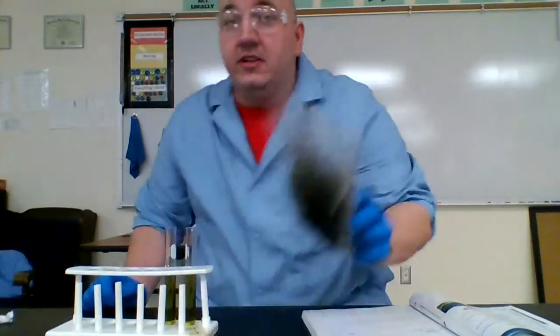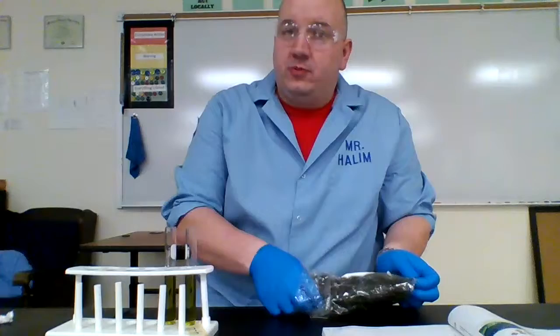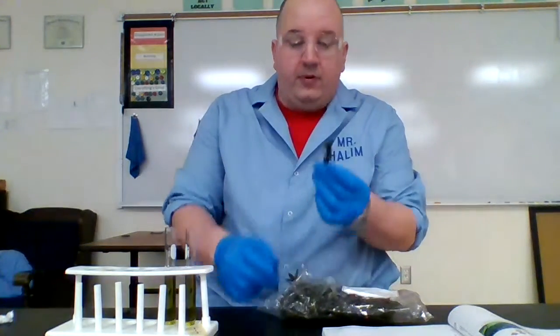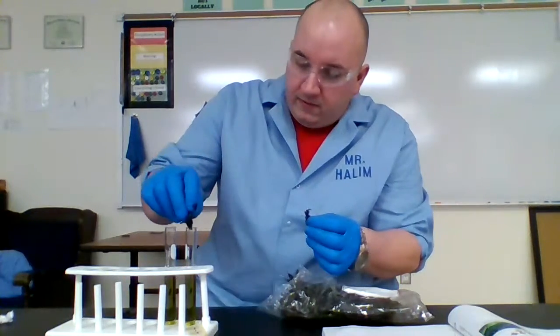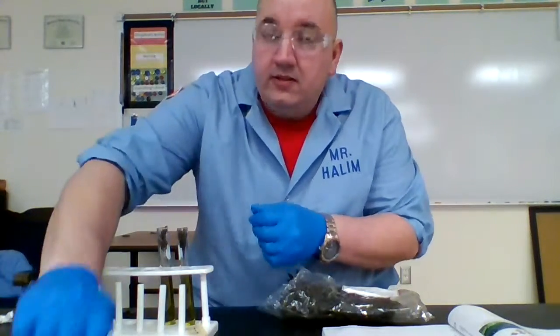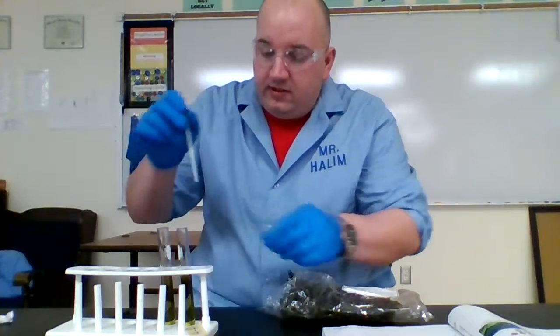So at this point, you're going to need to see your teacher, and you need to get a couple sprigs of Elodea plants. You're going to need to get 2 of them. We'll probably give you one chunk like this, and then you just need to break it in half, place it down into that. This is where you may want to use your straw. Just make sure it's pushed all the way down in there.